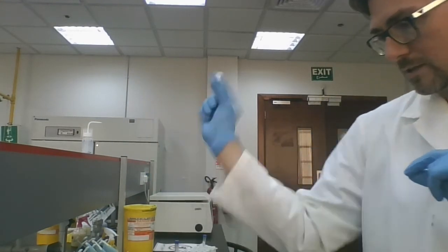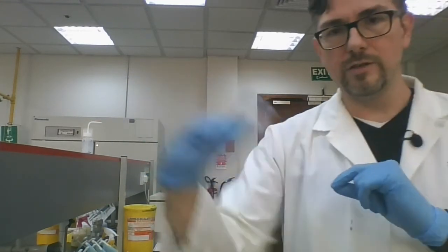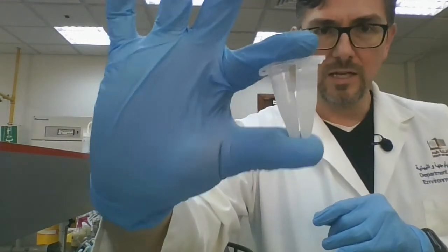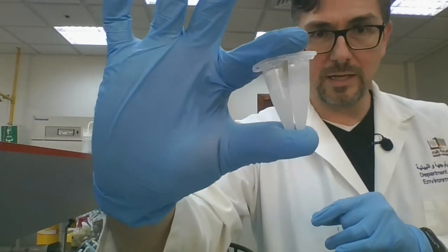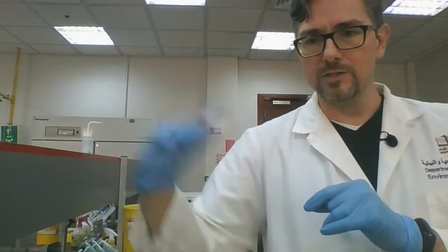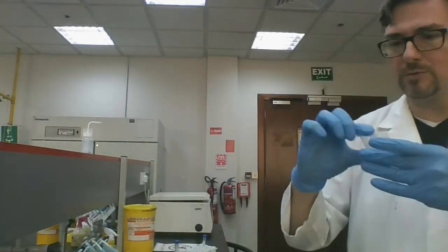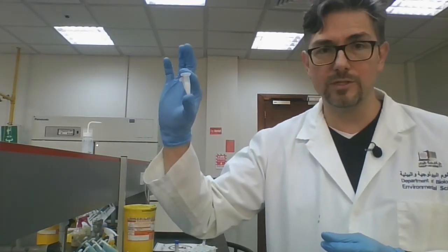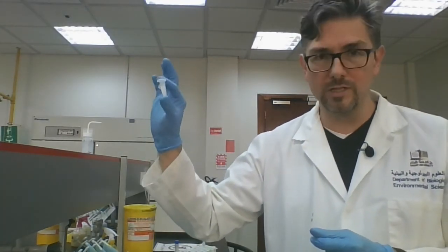Okay, so you can shake it just in your hand. You don't have to use a vortex. Some people like to use a vortex, but you can see even after shaking it, it's pretty cloudy because the organic phase and the aqueous phase have mixed fairly well. What you have to do now is just let them separate. You can either wait 20 minutes, half an hour for this to happen naturally, or you can just put it into the centrifuge. And that's what we're going to do.